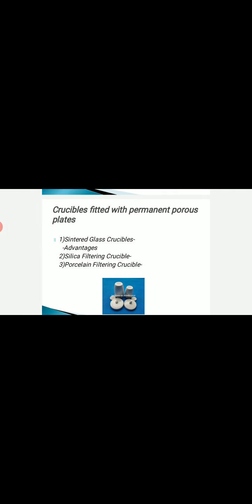Sintered glass crucibles are generally made of resistant glass like Pyrex and have a porous disc of sintered ground glass fused into the body of the crucible. They are resistant to temperatures of about 100 to 200 degrees Celsius.